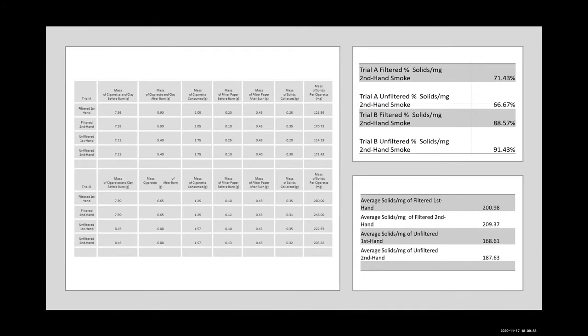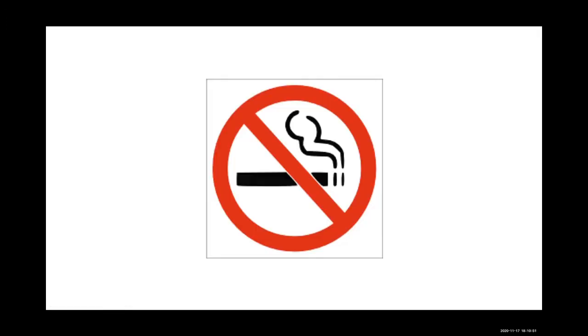This experiment should definitely be run again to try and work out any wrinkles and see if we can get some more accurate results. Nevertheless, it was really interesting. Even if our results weren't super accurate, I think the moral of the story is clear.